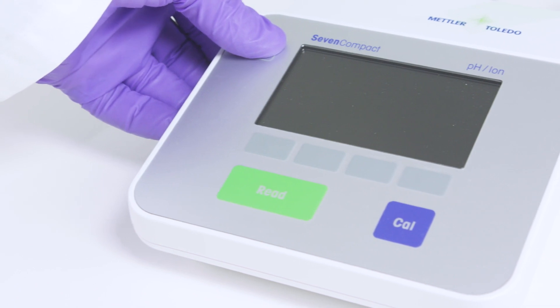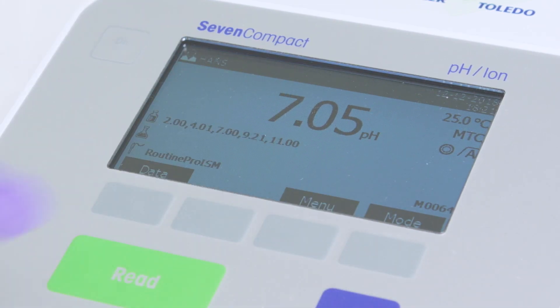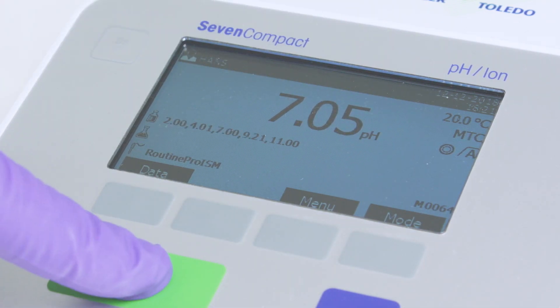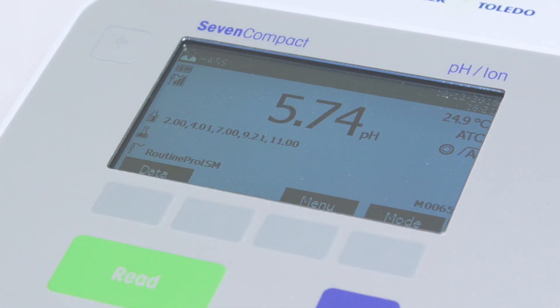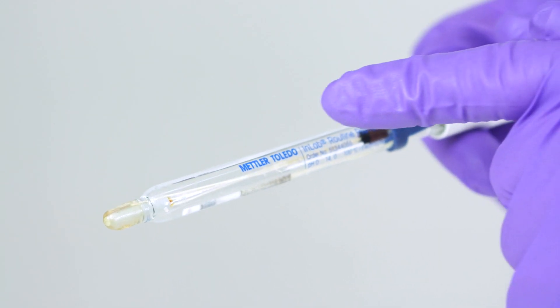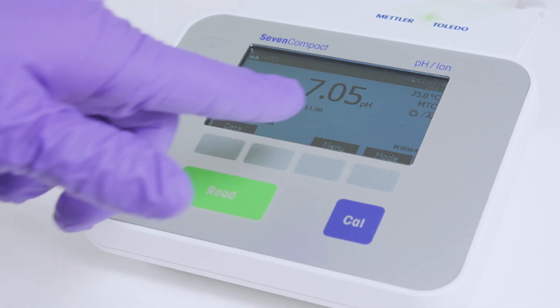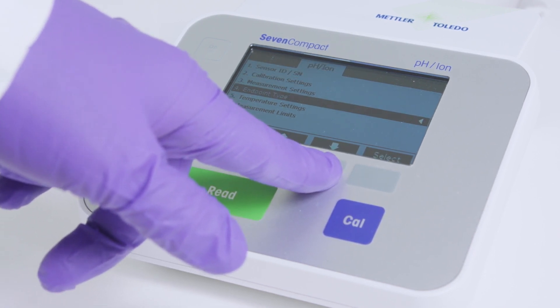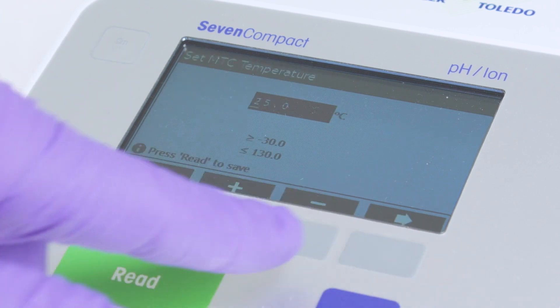Switch it on and press mode until you're in pH mode. The device will start in manual temperature control mode by default. If your sensor has an automatic control, press read to set this function. As you can see here, the meter is reading ATC. This means the temperature is automatically set because the sensor includes a temperature probe. If your sensor doesn't support this function, you can set the temperature manually by pressing menu, then selecting temperature settings, then setting MTC temperature. See? We said this was easy.